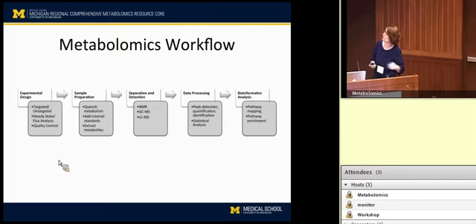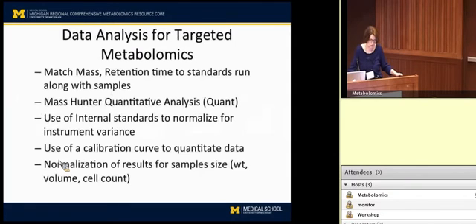Okay, so again, everybody's been showing this workflow, but we just want to always center you back to where we're going, how we're going through all the steps. And right now we're at the data processing step. How do we detect peaks and quantify them, identify them, that sort of thing. We won't talk too much about statistical analysis for untargeted data because we have more talks about that later.